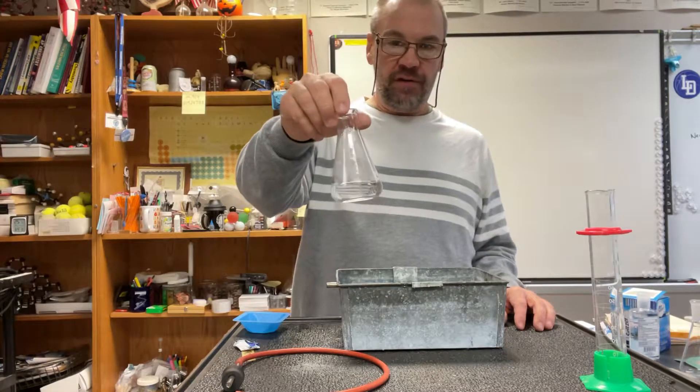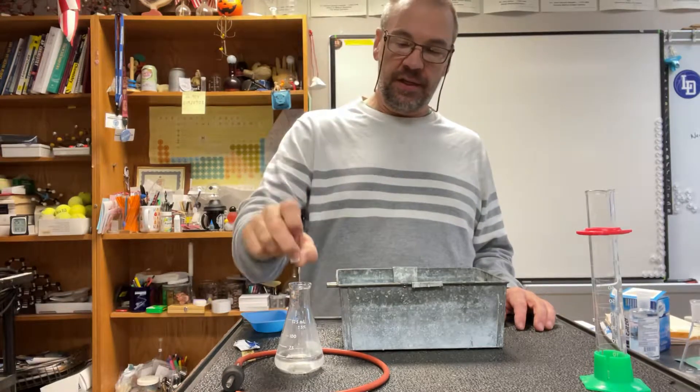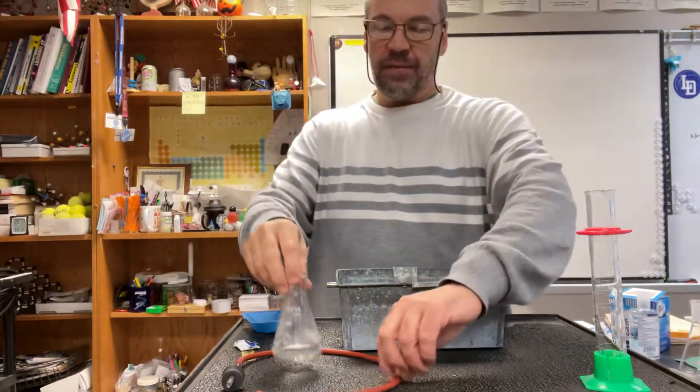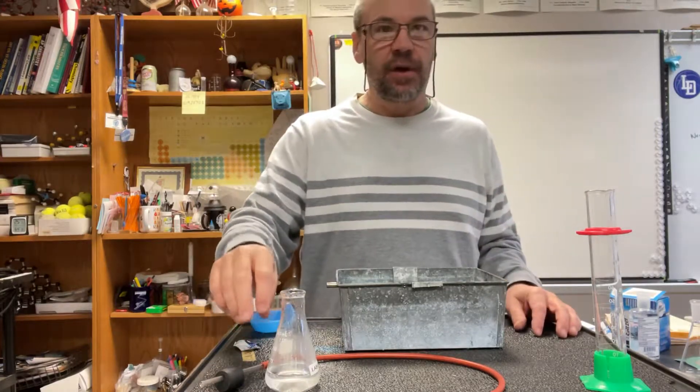This is called an Erlenmeyer flask, and what we're going to do is put a small piece of Alka-Seltzer in the Erlenmeyer flask and then the reaction will take place. One of the products of that reaction is a gas, and the gas is carbon dioxide.